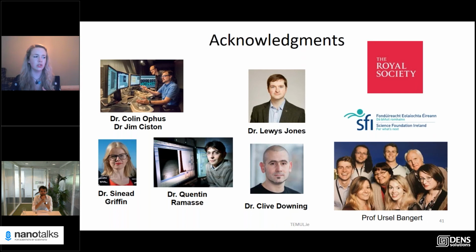I have done in-situ biasing with iron iodine boracite, and that's not as malleable, so it's just easier. So it really depends on the material. I think we did some in-situ biasing with lead titanate, and again that was easier just because it wasn't as malleable. That has its own problems, but it didn't have that issue. So the main thing was that the copper chlorine was like milling glass or something amorphous. That was the issue I had anyway.